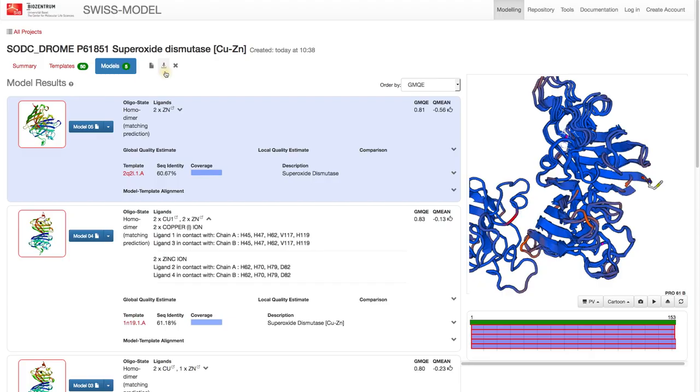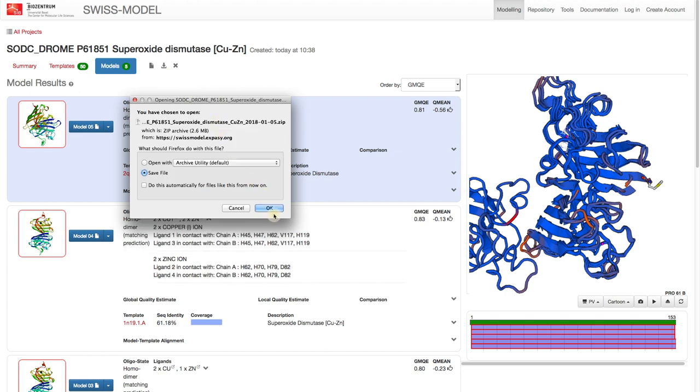Or better yet, grab the whole project. This not only saves all models, but also the template search and the quality estimates.